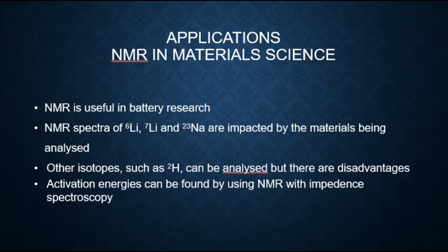There are challenges to analyzing these nuclei, however, because the quadrupolar coupling is large and the gyromagnetic ratio is low, which influences the detectability of the NMR. Information on ion dynamics, such as activation energies, can be determined by using NMR along with other analytical techniques such as impedance spectroscopy.